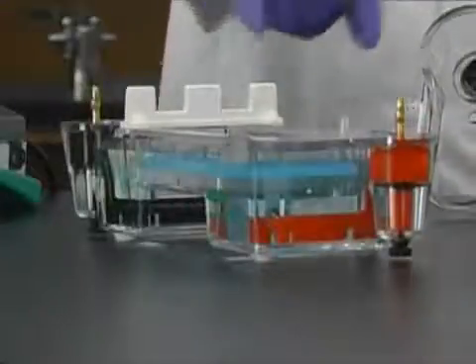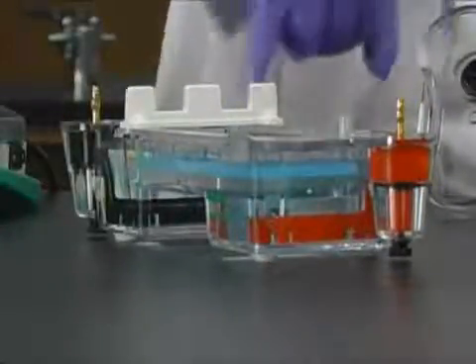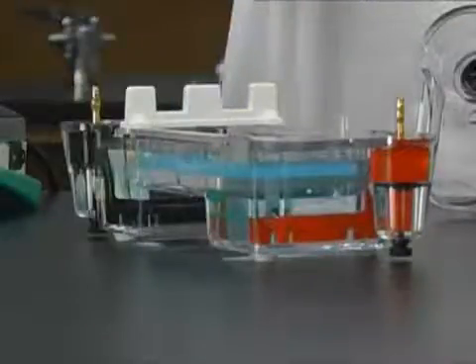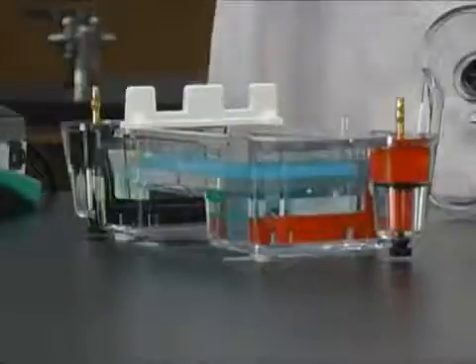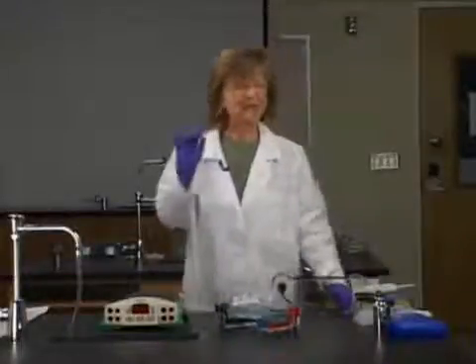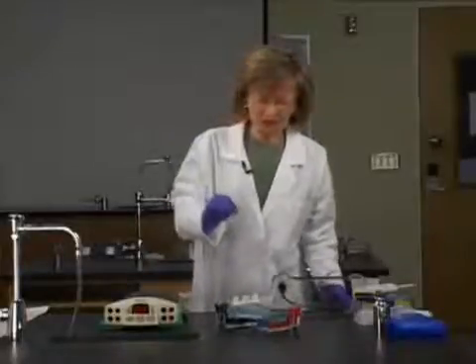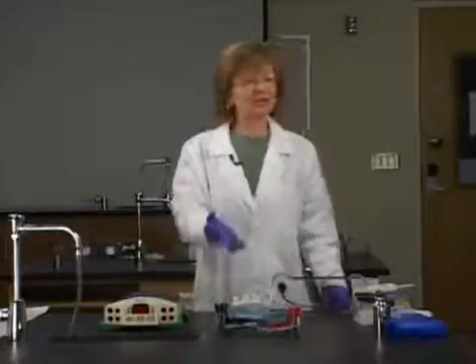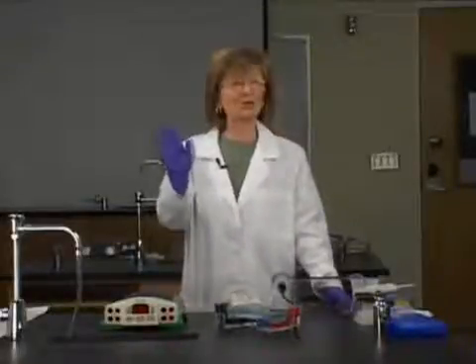And I've just put it down into the gel rig. The rig has the same buffer that we made the gel with, the 1 times TBE buffer. This has been sitting in there for a couple of minutes because we want the buffer to be able to get around the teeth of the comb so we can easily extract the comb. And then after we do, we're going to put in the DNA that we digested overnight using restriction enzymes, and then we're going to run it.